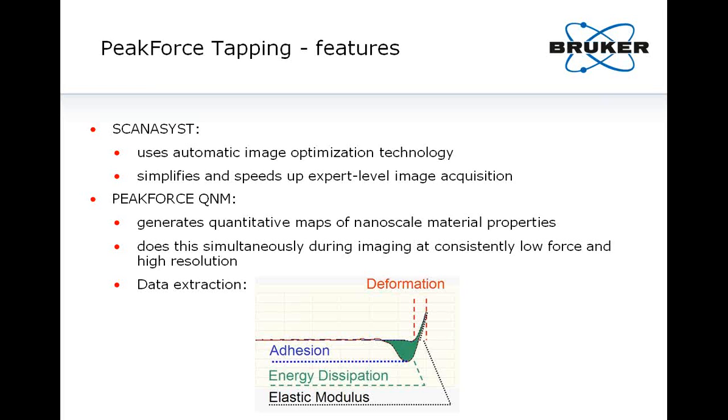I have to precise that this is a DMT fit, a DMT calculation. I don't have time right now to detail what this is, but I can answer any question related to this at the end of the presentation. The dissipation is obtained by integrating the area between the two curves, which is actually missing on that slide. The peak force is the maximum distance on the y-axis between the turnaway point and the baseline.